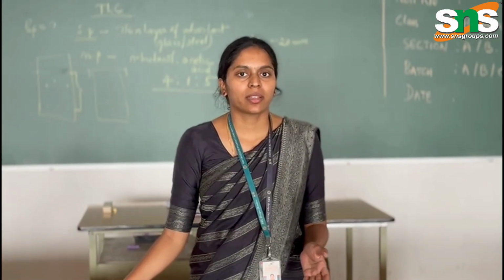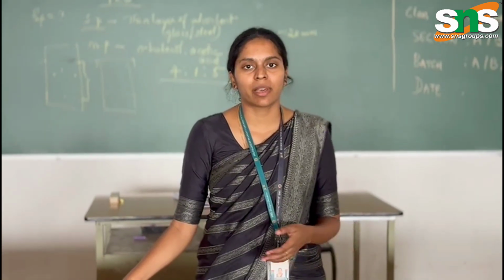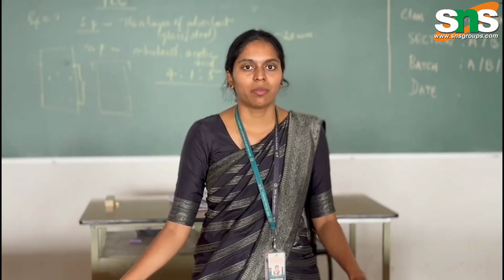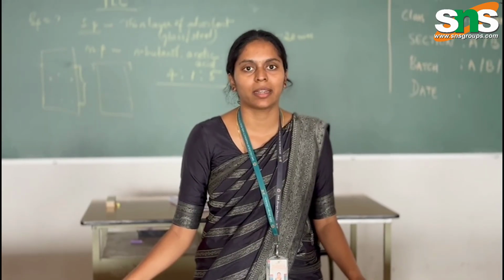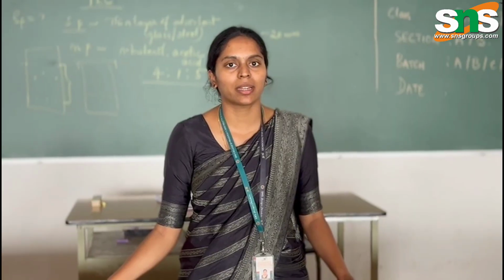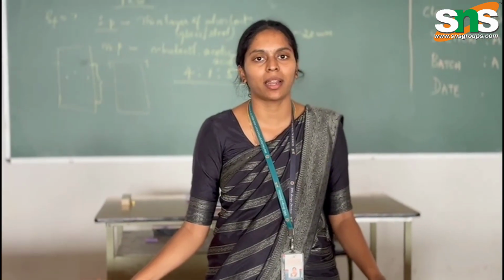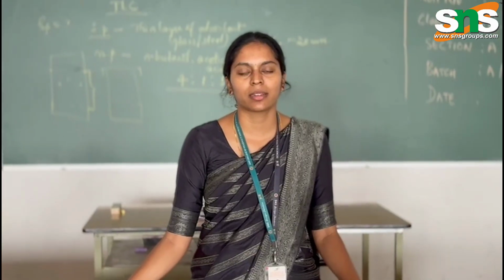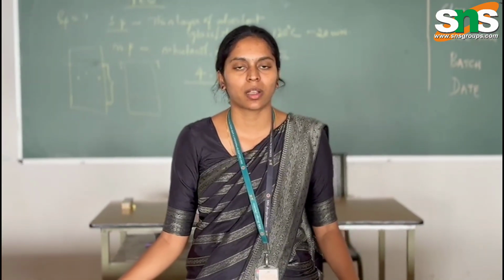As we can see, various application questions were asked to students, and they have answered everything clearly with the working principle of that particular analytical instrument. We have talked about various analytical instruments like weighing balance, nephelometer, fluorimeter, biochemistry analyzer, distillation unit, as well as hot air oven.